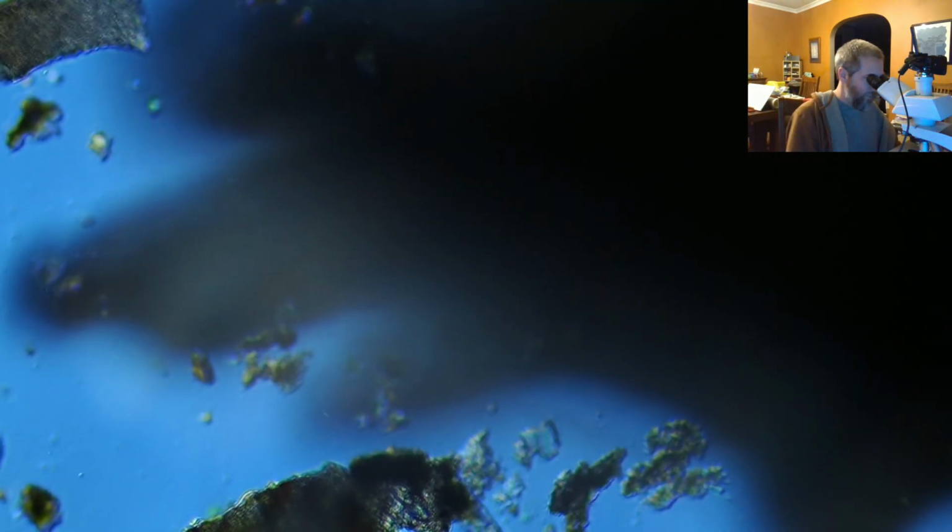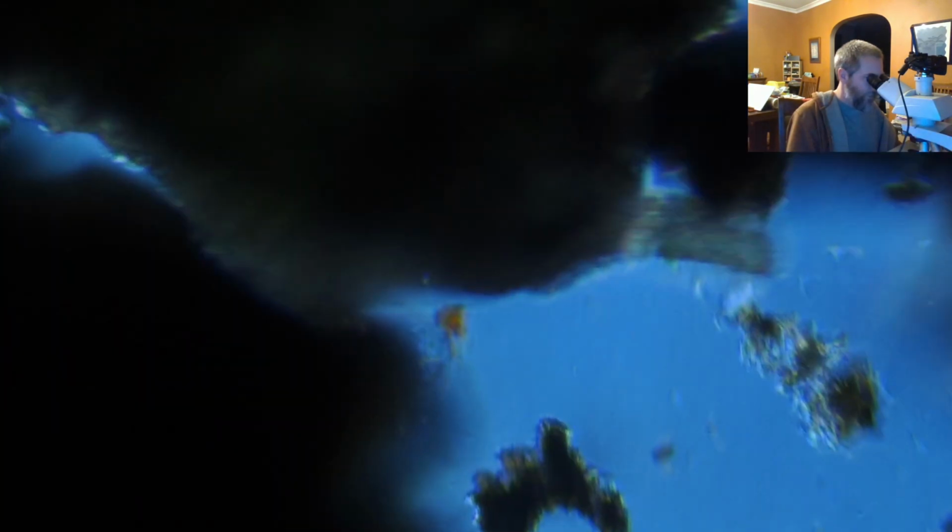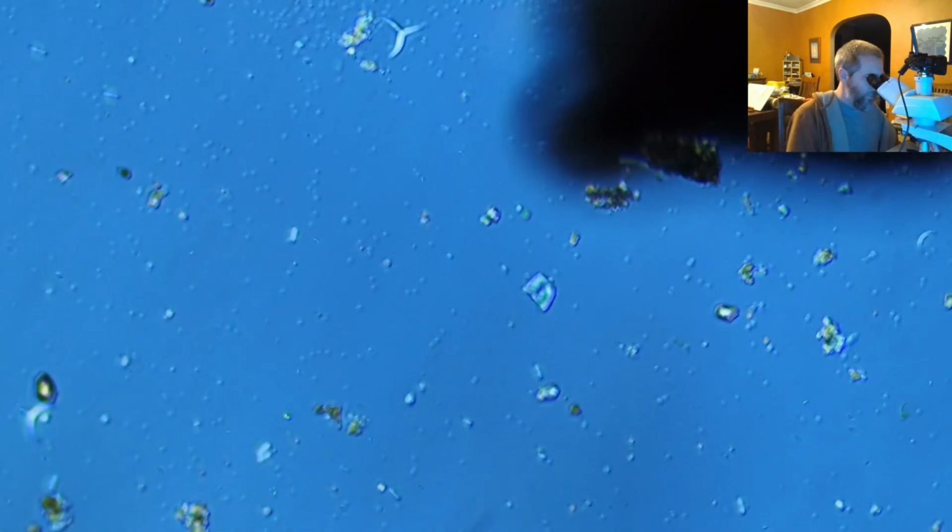You can see what they've been eating just right there, right through them. You can see how well they've been eating in some cases. And you can also see their eggs. So a lot of the translucent metazoans, you can actually see their eggs, either they carry them around outside of their body or inside their body, which I think is kind of cool, because you can tell, oh, that one's getting ready to lay eggs, or its eggs are getting ready to hatch or whatever.